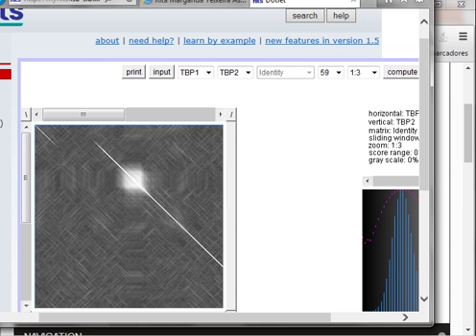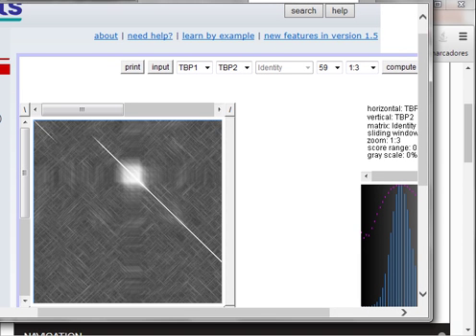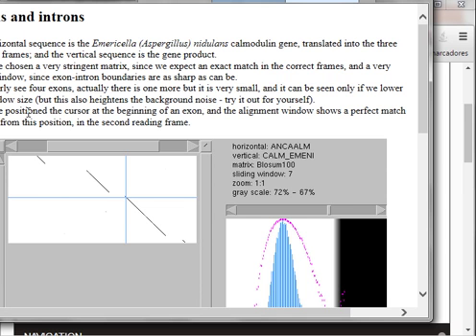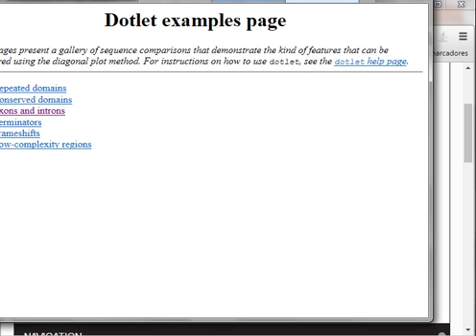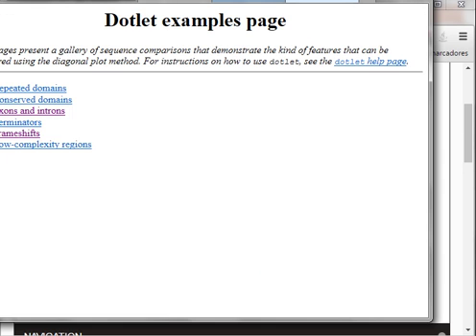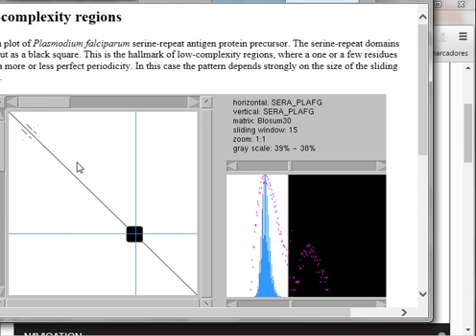So this graphical alignment is very useful, for example, to see repeated domains, conserved domains, and you can check also the introns and exons, comparing a gene with its transcript. So in here you could check that it has 3-4 exons, that is the sequence that is corresponding from gene into the transcript, the cDNA. You can see also frame shifts, if there is a shift between the sequences, and also check low complexity regions.